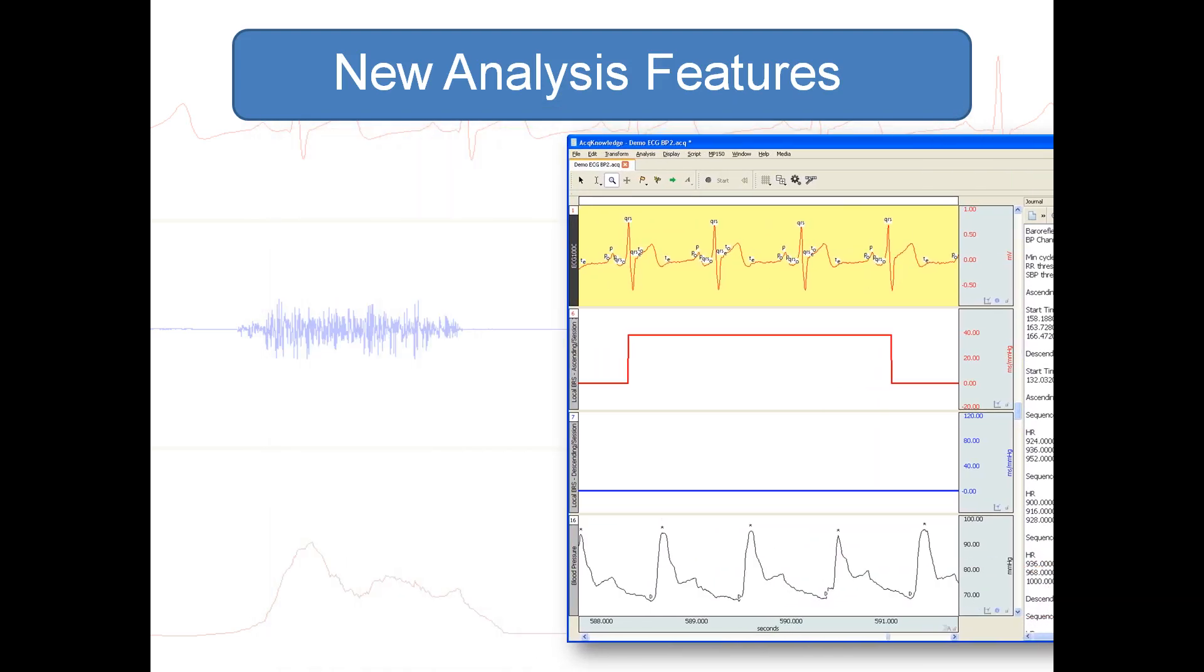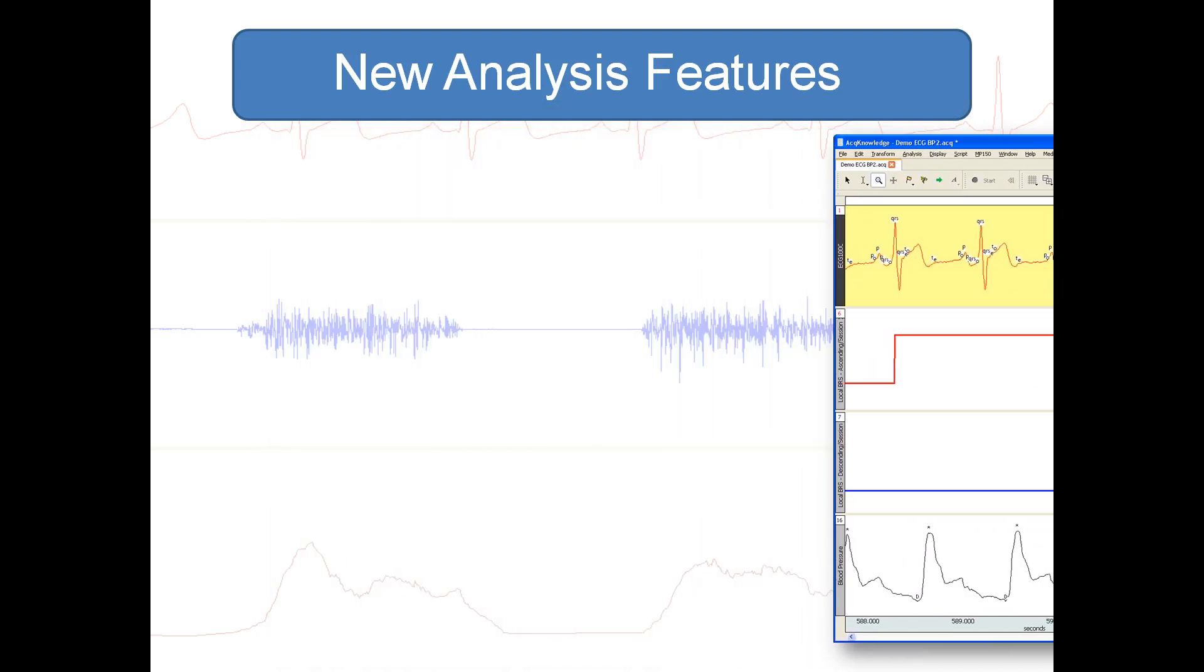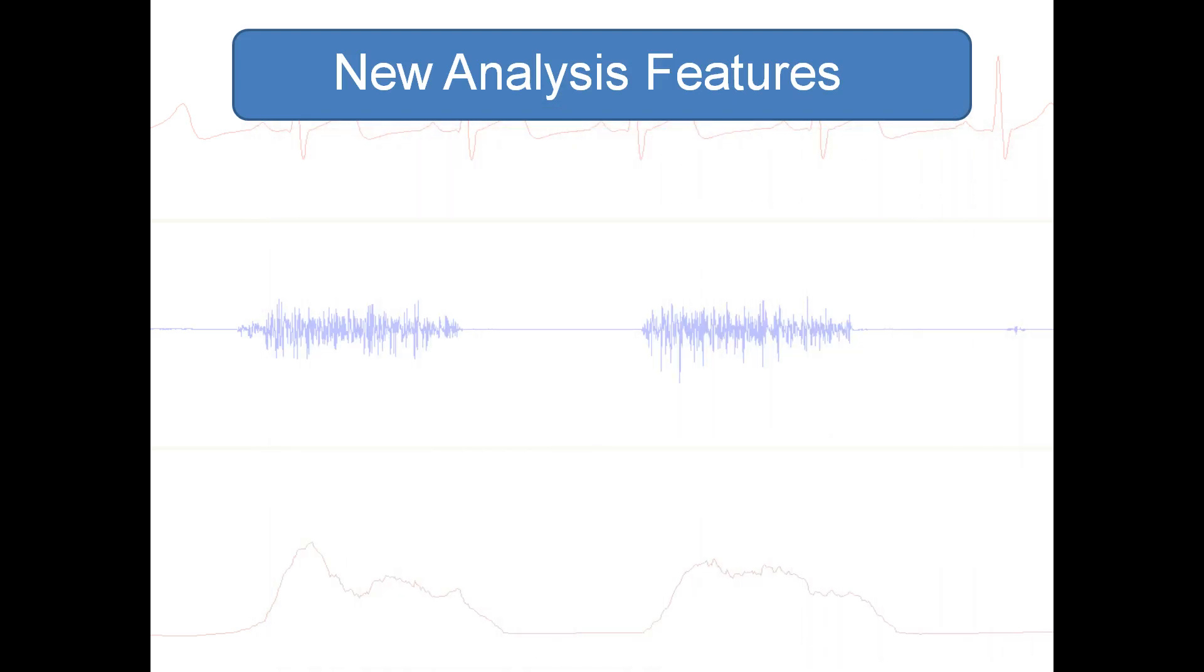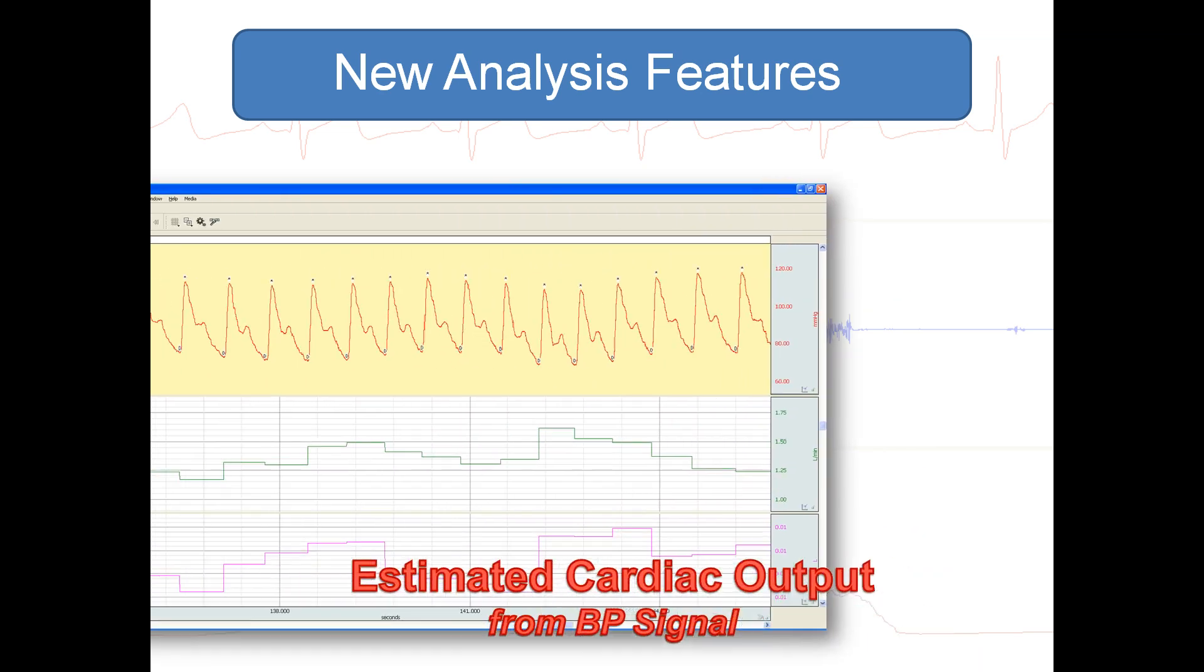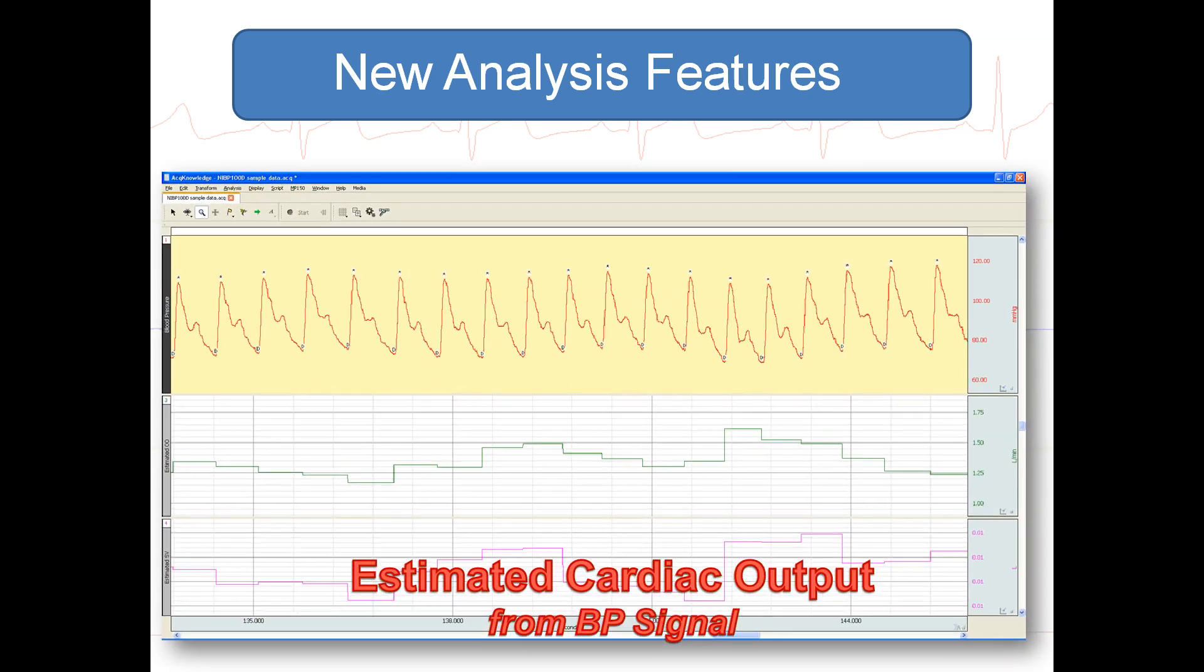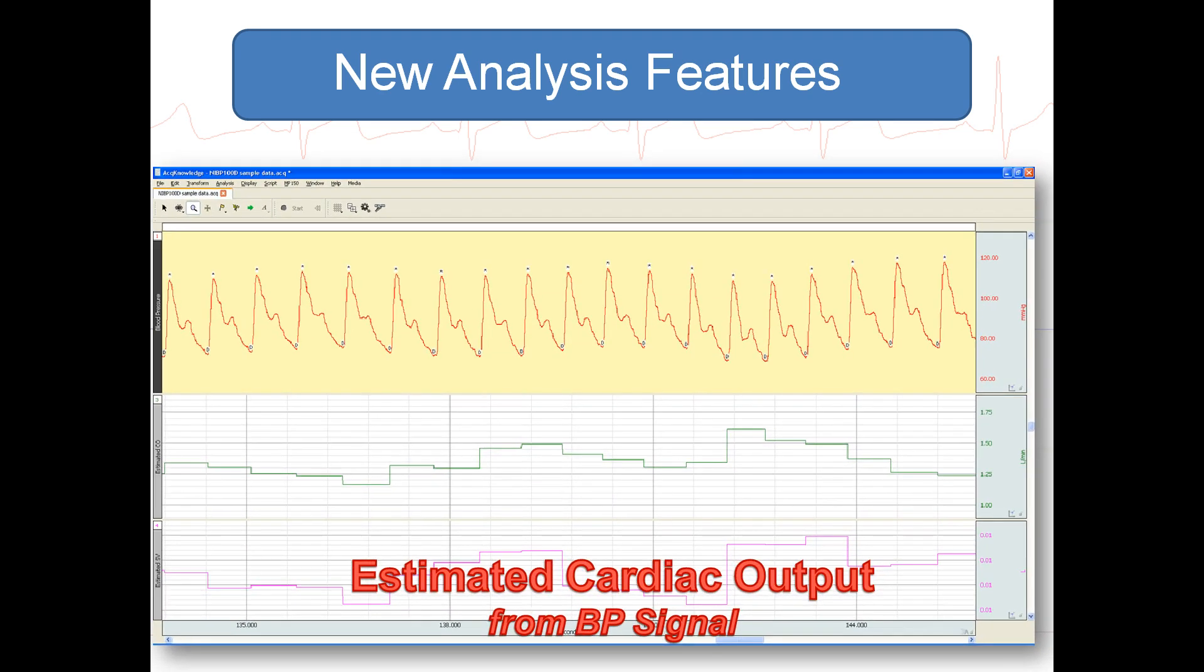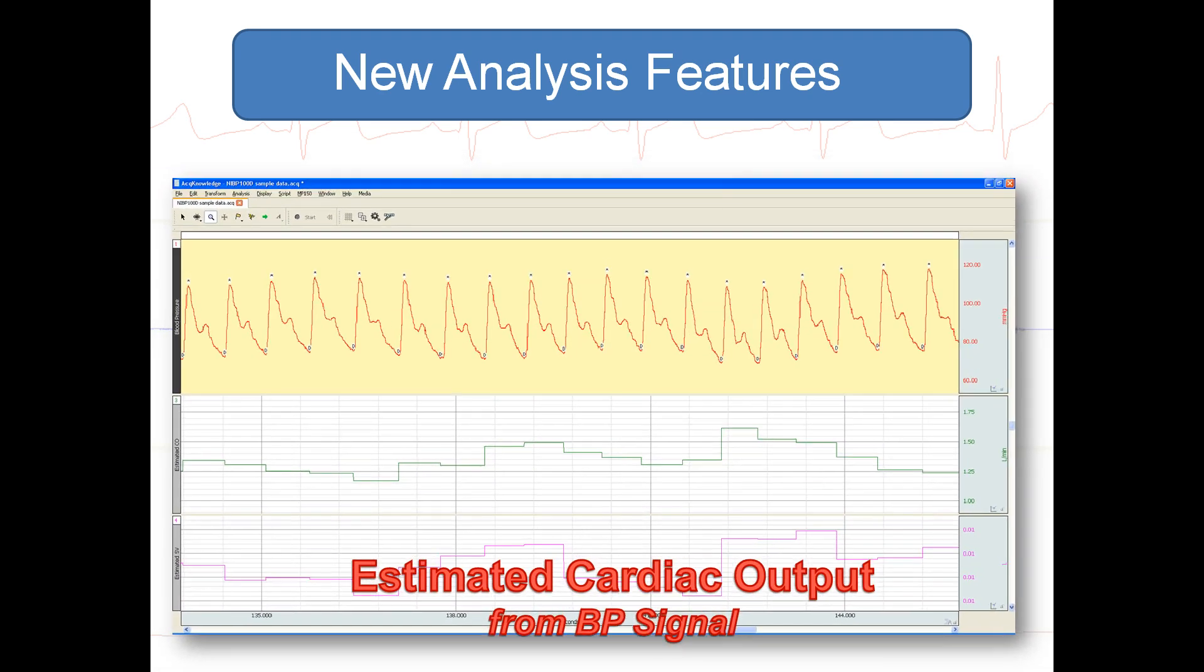AcqKnowledge also now includes a routine to calculate estimated cardiac output from a continuous non-invasive blood pressure signal.